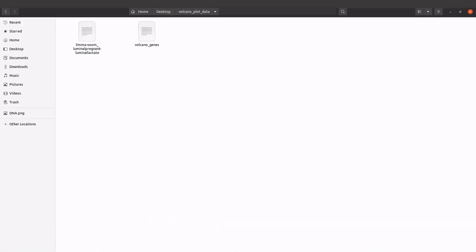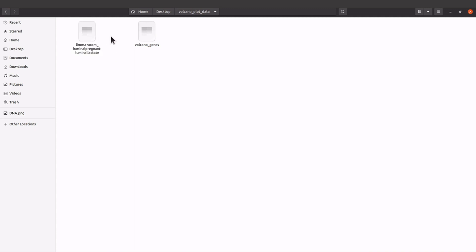Before I proceed, note that these are CSV files — actually they are tab-separated files. So if you are opening them in spreadsheet software, set the separator to 'Tab' and that will be fine. Now let's get back to our Galaxy platform.